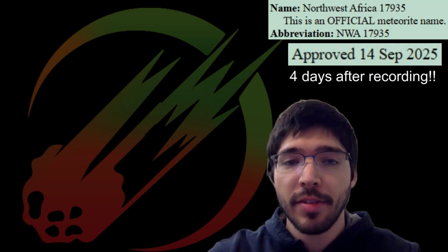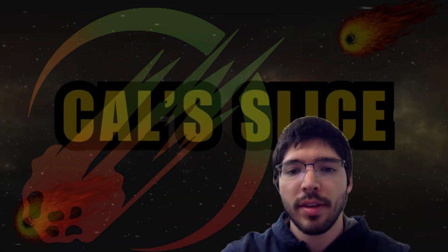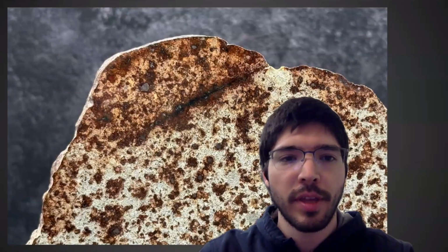But the good thing, at least, is that once it's on the spreadsheet, we can look at every site that we looked at and we can see exactly what specific minerals we have and what their compositions are. Then I have several charts that are going to help with the classification process. For example, what type of chondrite we have, what shock stage, what weathering grade, things of that nature. And then, of course, I have the Meteoritical Bulletin official submission form Excel spreadsheet to submit our sample on. So that's sort of the approach I'm thinking we'll do.